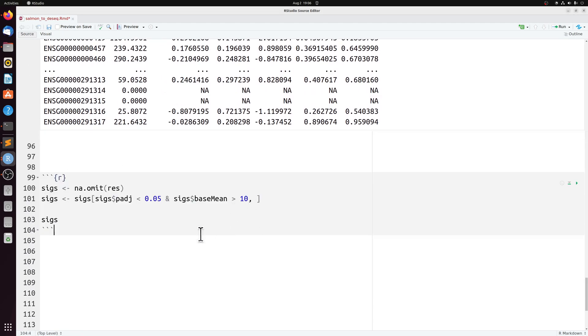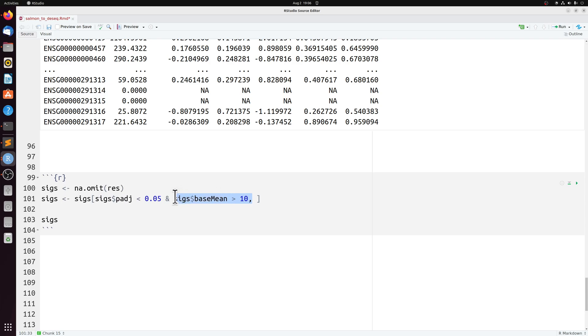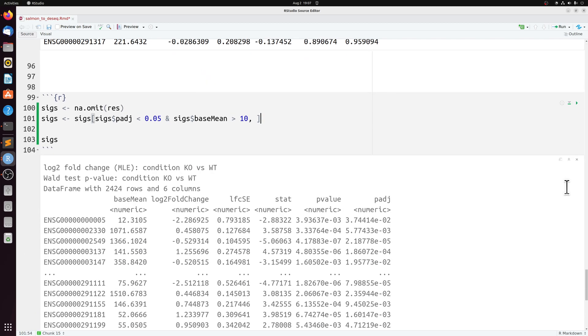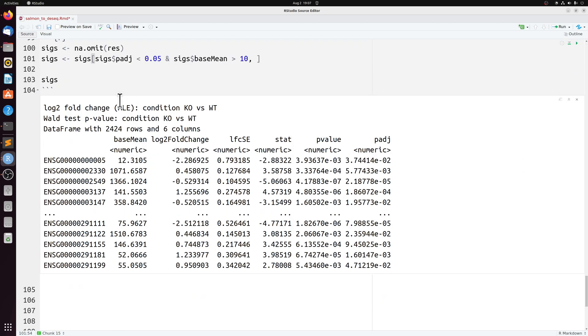And for example, if we wanted to look at just the significant ones, we can get rid of NAs and then filter by the p-value and the base mean, since genes with very low expression are going to be highly variable. So in this case, we have 2400 differentially expressed genes. You can filter by up or down or however you want to do it.